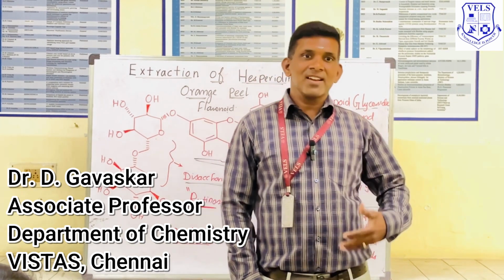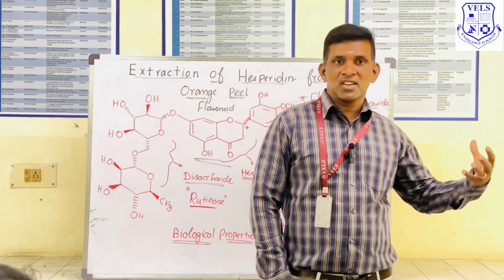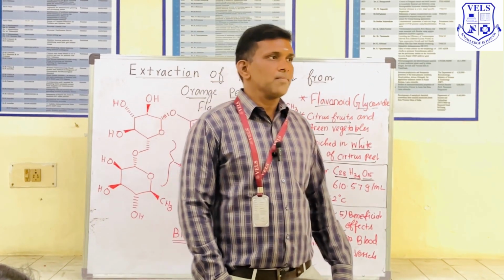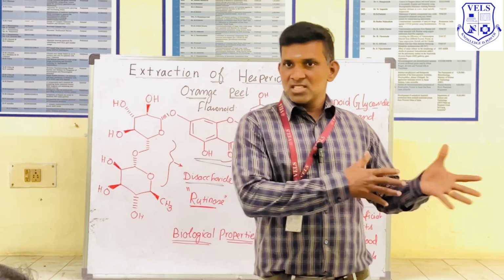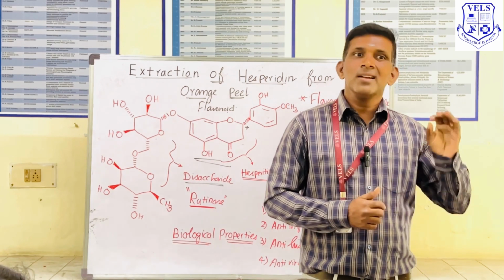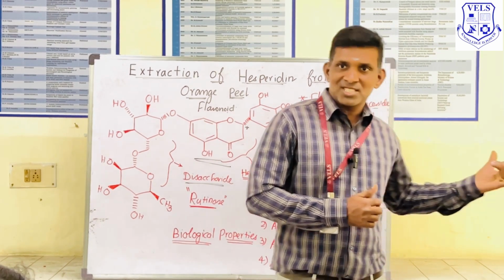Thank you, Muthukumar sir. So sir already gave the introduction on the chemical and the biological properties. So how can we extract this Hesperidin from orange peel? What is the procedure? I can add one more importance of this Hesperidin.